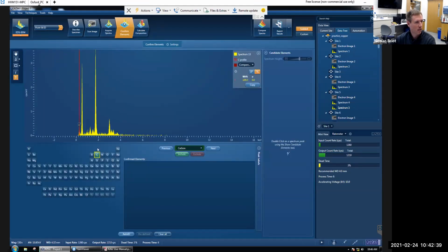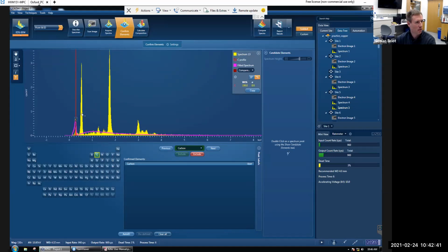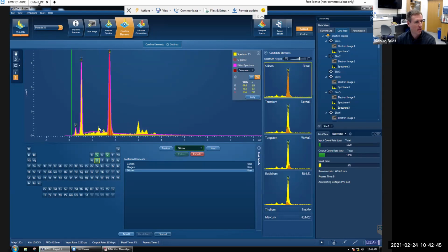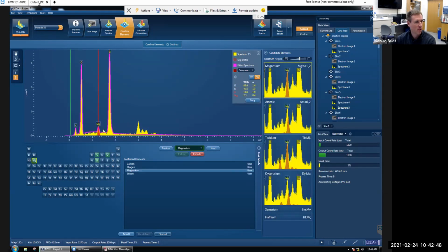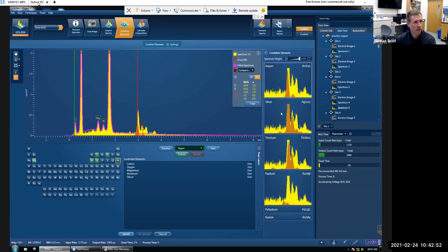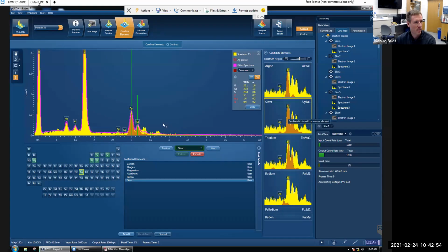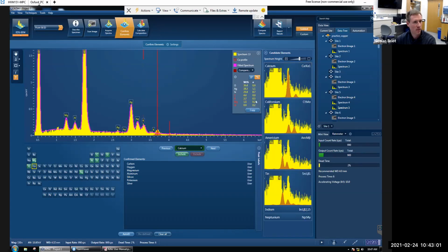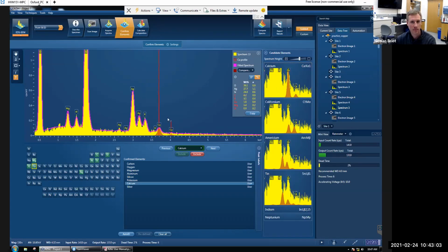So again, carbon a little bit. Oxygen, you're gonna have the silicon, magnesium. So just like we saw before, that's on the glass most likely, but right here, silver. You see it has several peaks. So yeah, we have all of them. And the potassium that has an overlap. So you can see it, calcium. All right. So that tells me that yes, you do have silver.